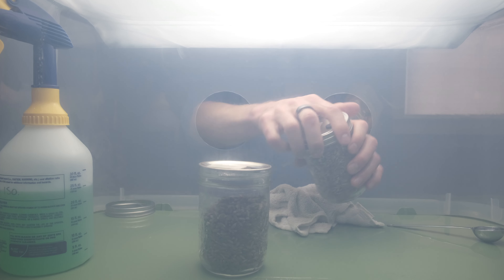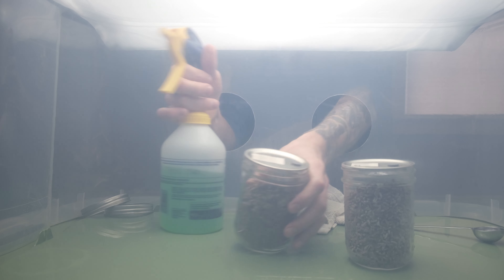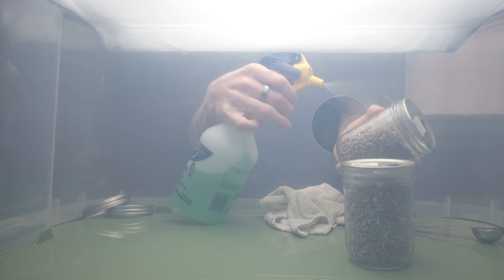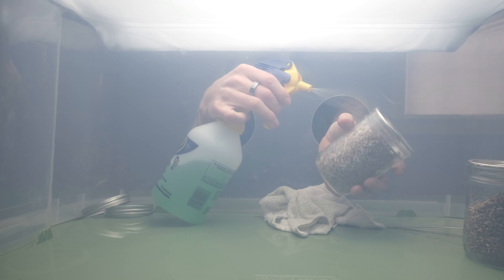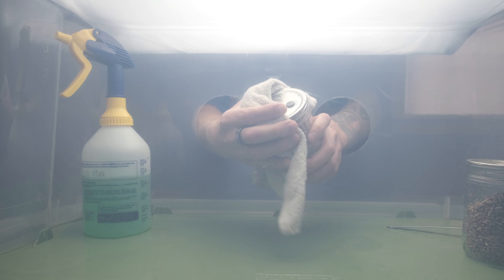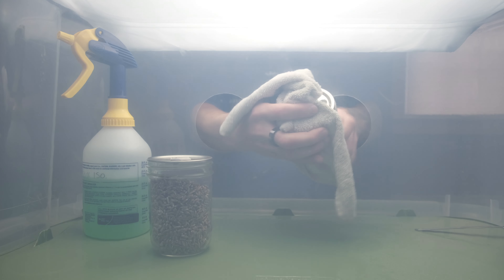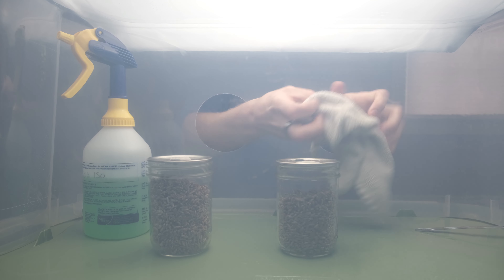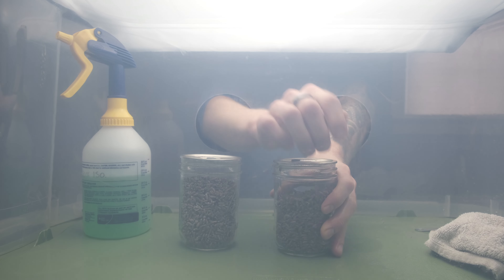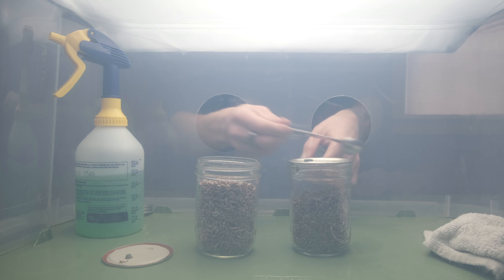I remove the rings from the jars and set those aside, then spray the outside of the jars — particularly the lip right underneath the lid — with isopropyl alcohol, and give it a wipe down.